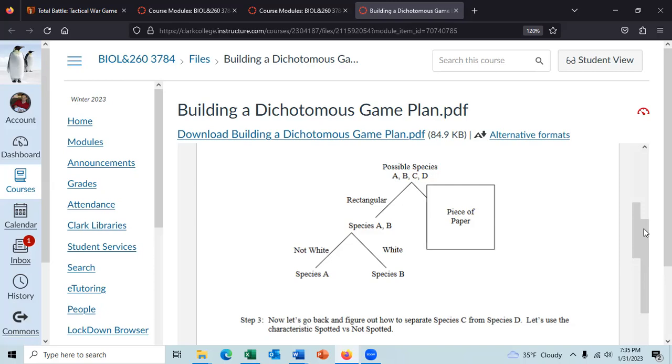And then on Sunday, I will have you do the gram stain on your unknown. And you are not going to look at the results. You will only make the slide. And then on Monday, you'll do the PR lactose test. And you'll get all the results in one email on Tuesday. But you will start the gelatin hydrolysis first, then the gram stain, and then the PR lactose test. So it will be following dichotomous logic.